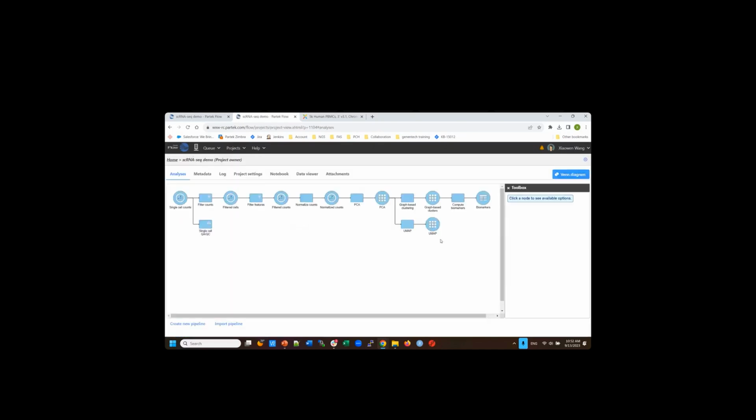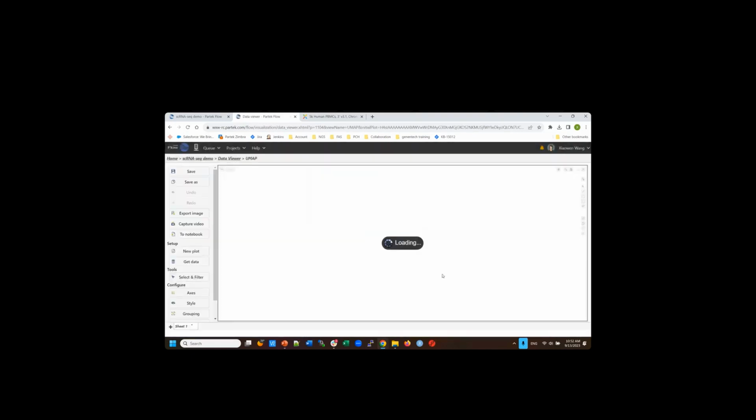clusters. So we are going to use the information, visualization, and statistics based only on the gene expression profile to generate the result and the biomarker information. Now we're going to do the cell type classification. Okay, so let me just open the UMAP again.